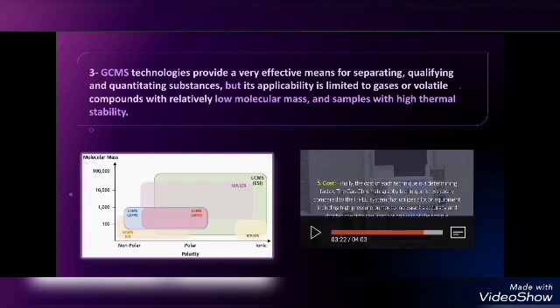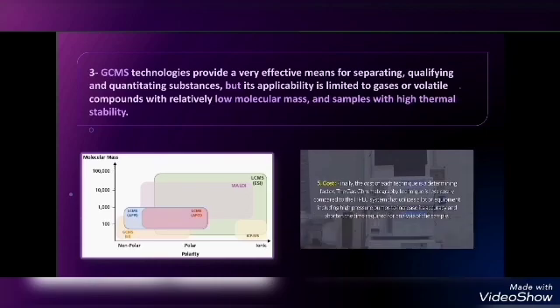5. Cost. Finally, the cost of each technique is a determining factor. The gas chromatography technique is less costly compared to the HPLC system that utilizes a lot of equipment, including high pressure pumps to increase its accuracy and shorten the time required for analysis of the sample.